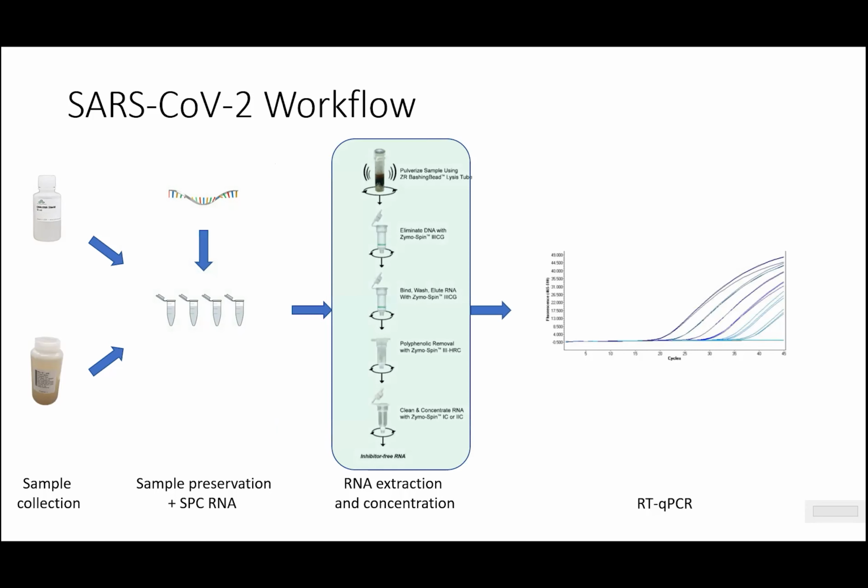There are several commercial kits available. We currently prefer Zymo's Quick-RNA Fecal/Soil Microbe Microprep kit. For us, it checks all the boxes on what we're trying to do with this step. In particular, it allows us to extract RNA from both solids and aqueous fractions. There are also 2 inhibitor removal or impurity removal steps. The kit also includes a concentrating column that allows elution volumes in as little as 5 microliters. So a lot of advantages that we like with the Zymo kit.